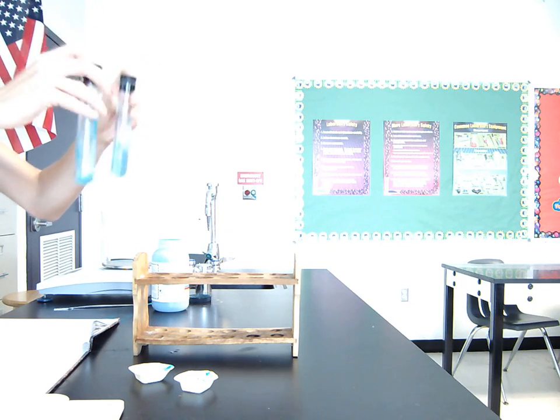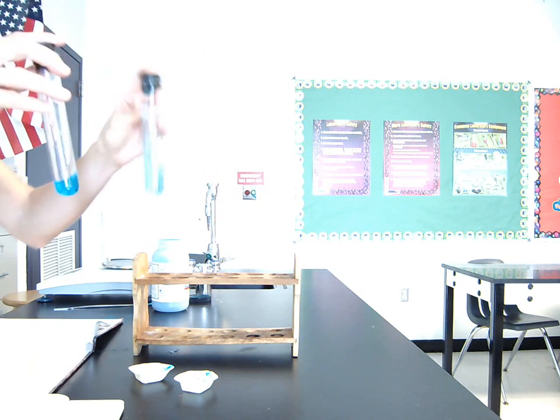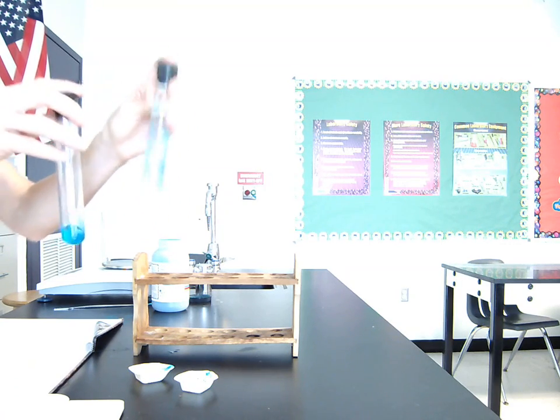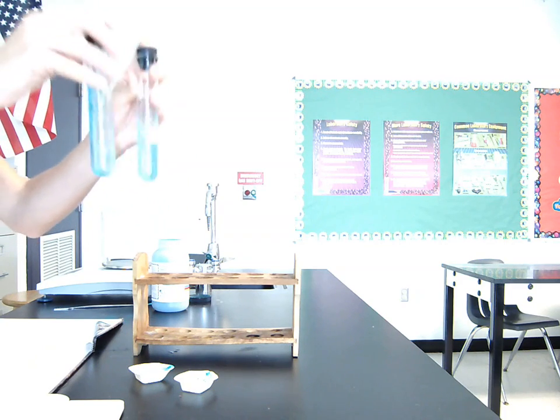It is interesting to note these solutions actually get cold when you mix them. The implication there is that this is an endothermic reaction, which is the opposite of exothermic. Exothermic is a reaction where it gives off a lot of heat and it gets hot. The opposite of that is when it gets cold during a reaction, which would be endothermic. So whatever this substance is, when it is mixed with water, there's some kind of endothermic reaction going on because it gets colder. So that's an interesting thing to note. Okay, almost there.